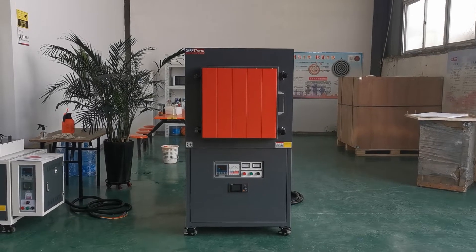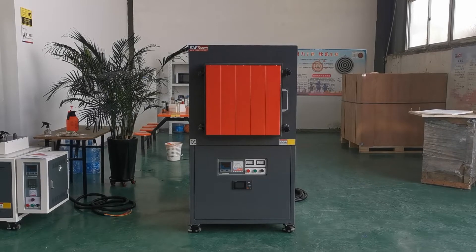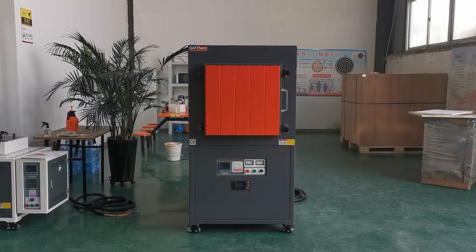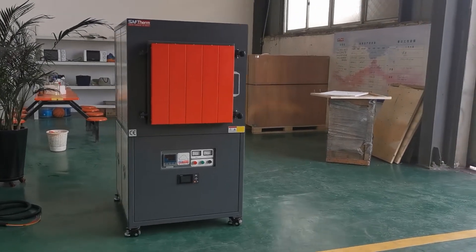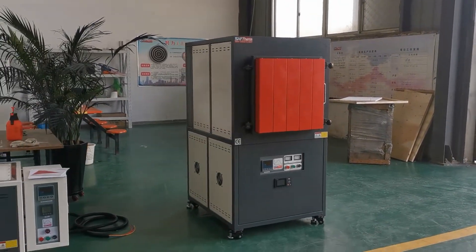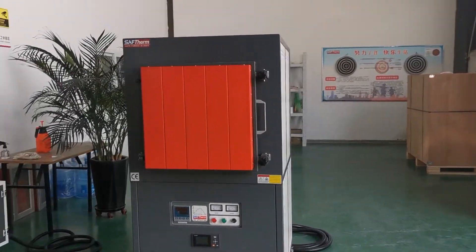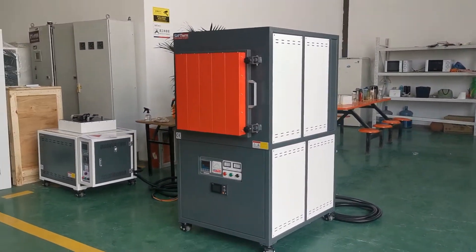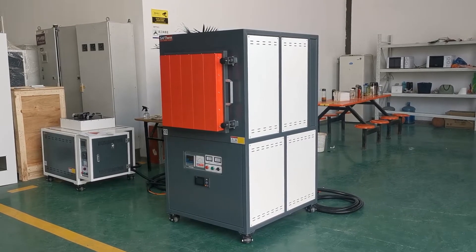Hello, this is a high-temperature muffle furnace. The max working temperature is 1600 degrees. Let's have a look at the furnace body on the left, on the right. The furnace structure is built with carbon steel.